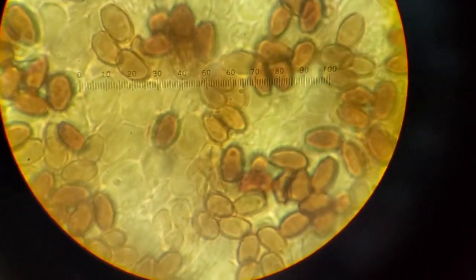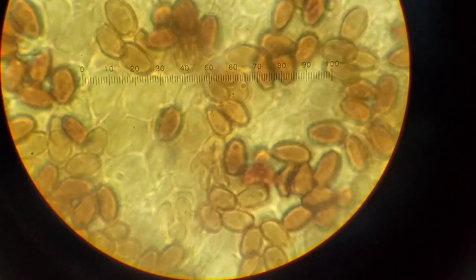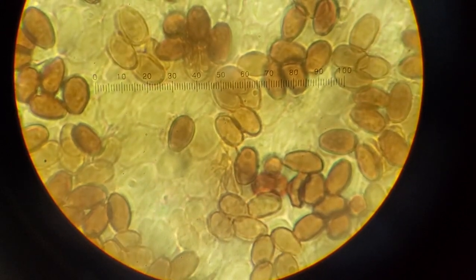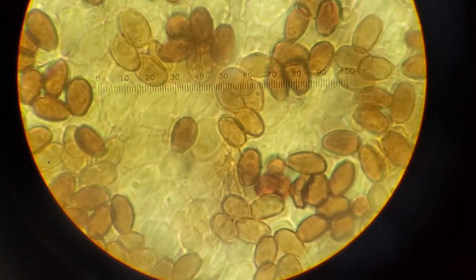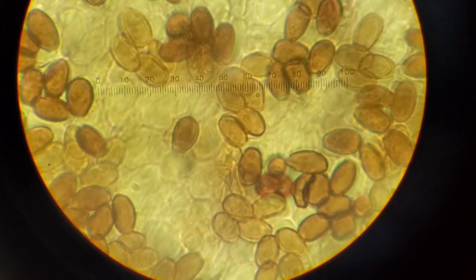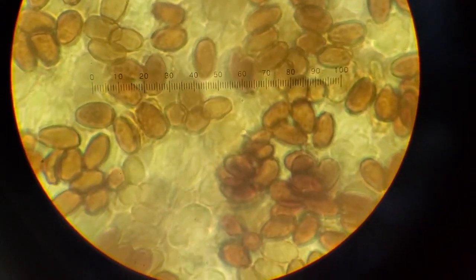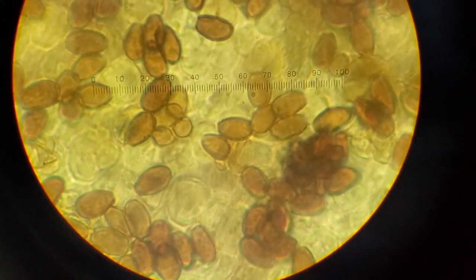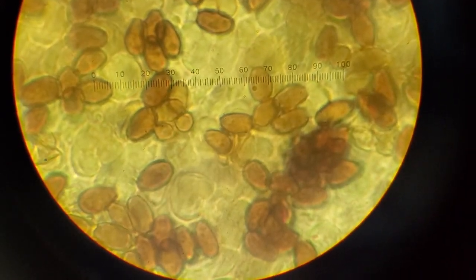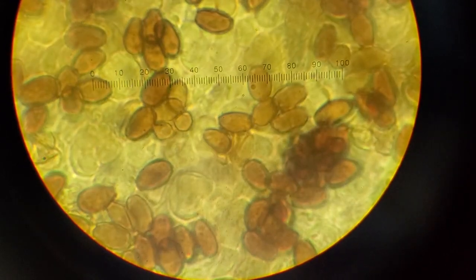Mainly due to the fact that you're not going to get them in the right position. It's very difficult to see the apiculus because they're probably still joined with the sterigma, and so it's blocking the view of the apiculus. It's a lot harder to see them in the appropriate view. You think you have them in the right view, but like I said, you're looking for apiculus, base, apex. In this case, apical. The apex is truncated, and you're looking for all these other features.